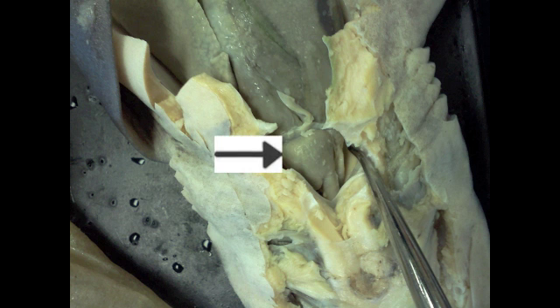The shark heart, shown with the arrow, has 2 chambers. The pig heart has 4 chambers. The shark heart has an atrium and a ventricle. The ventricle pumps blood throughout the body using arteries, with veins returning the blood to where it is stored, the atrium. The pig heart does the same, but it has 2 ventricles and 2 atria.